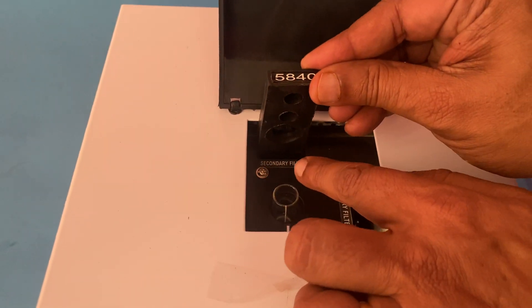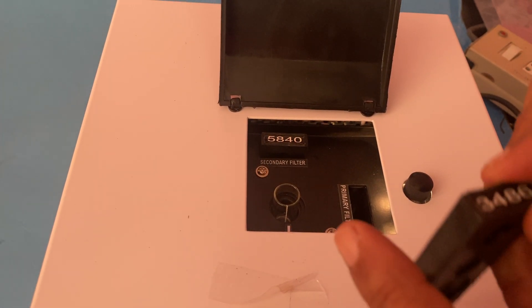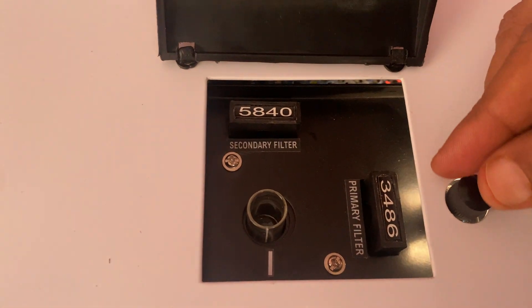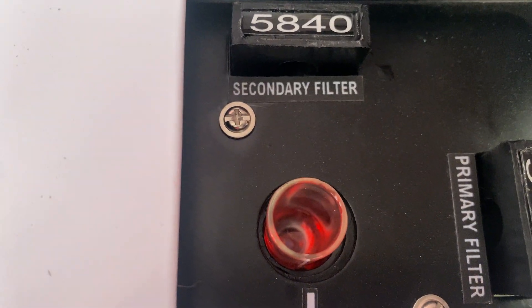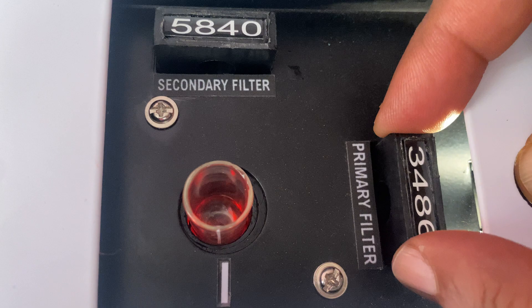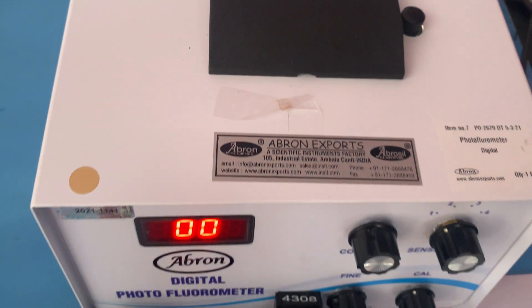I am putting in one secondary filter. It is written in the manual what the names of the filters are — primary and secondary. Now you can see, if I press this, the color changes inside. The color changes due to the effect of the filter. You can see the filters are rotating.